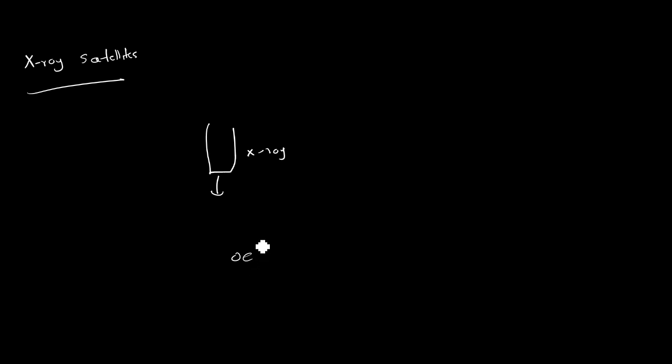Another variation that you can observe in the XPS is called X-ray satellites. These happen because of your X-ray source, right? When you have your X-ray source, these sources provide you with high energy photons. Sometimes these high energy photons can be focused on more than one specific electron, and these electrons will be emitted with a different energy compared to the normal one.